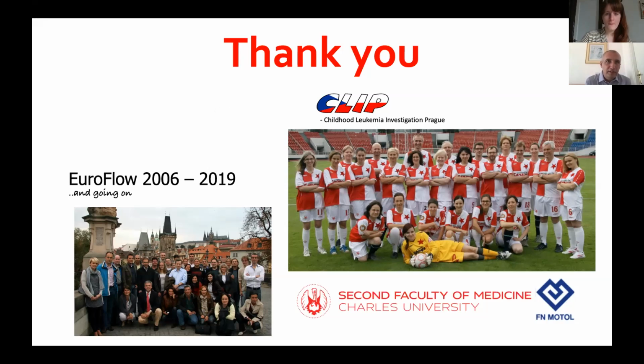So we have only started to use the Cytek instruments as of, I believe, 2 years ago in the consortium. So we are still gathering more experience. I don't have an answer for you, unfortunately, but you are right that they perfectly well use the concept of fixed voltages, the same as Sony. And I think this is one of the clear indications that this is possible, and we should not be so afraid of those concepts.